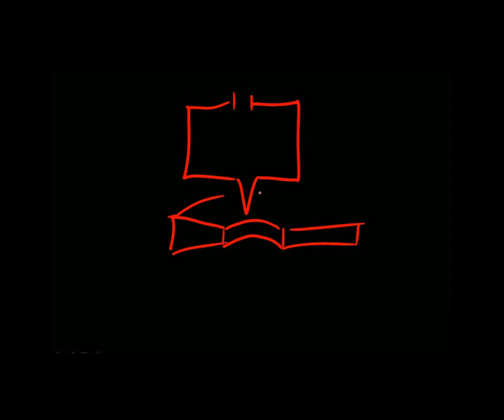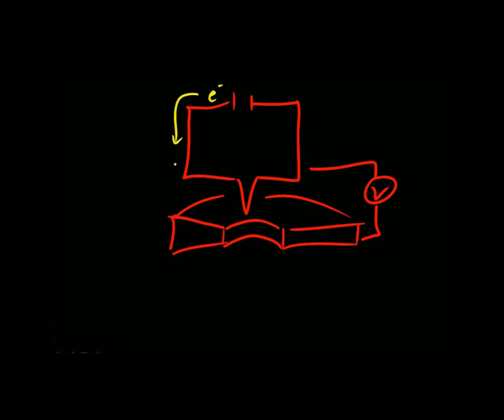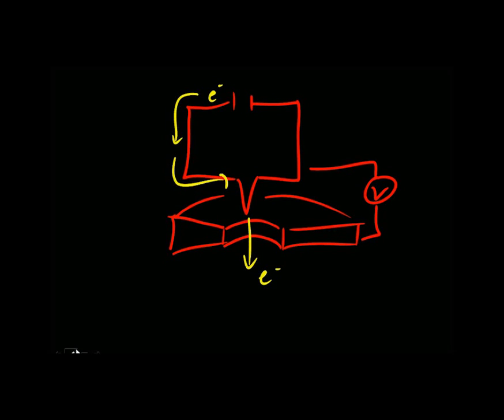So this is like a disc that we cut in half so we can see the front view of it. And basically all we do is provide some type of extraction voltage here, and then we have a potential difference, and this really helps to extract these electrons. Okay, so they're experiencing this force and this potential difference, and then they're accelerated down the column.